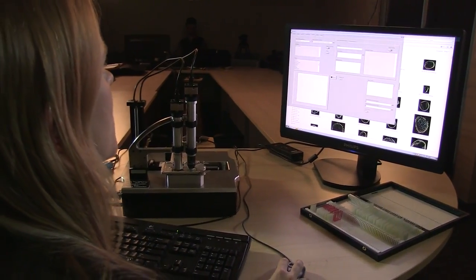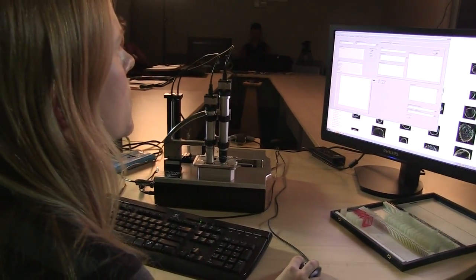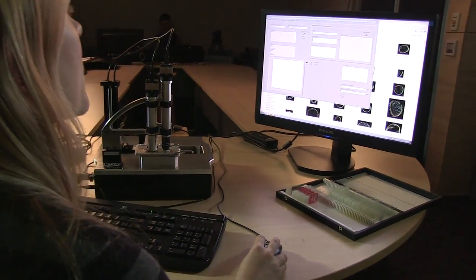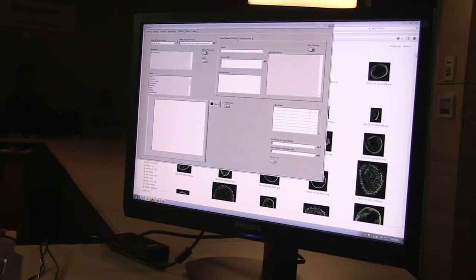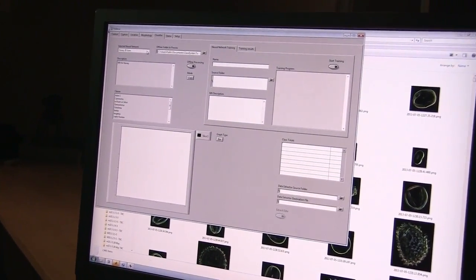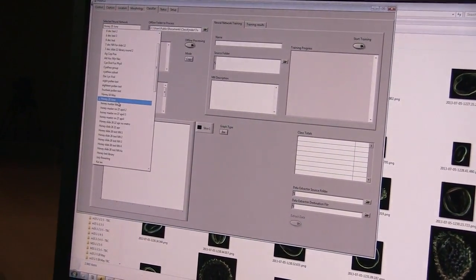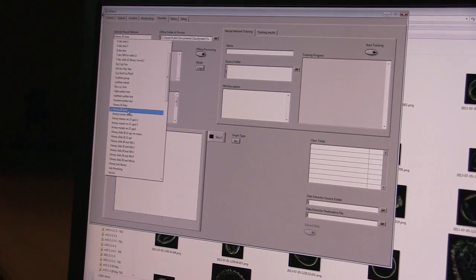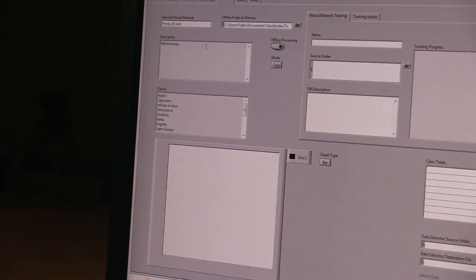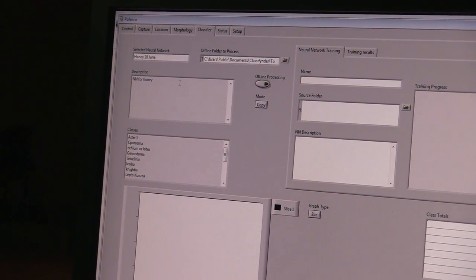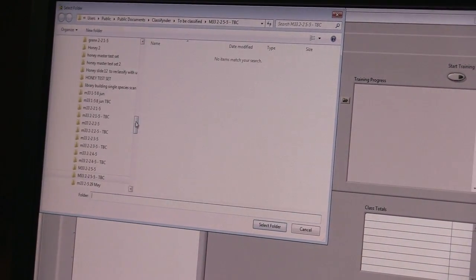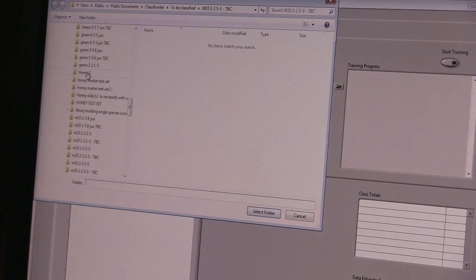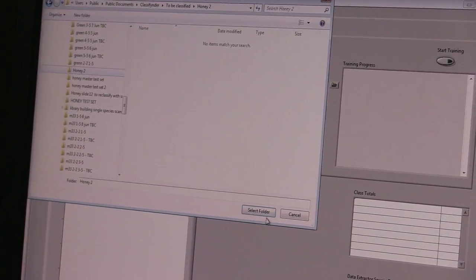So to classify those images shown in the previous folder, the system employs a neural network classification system by which the folder of images is given to the neural network which then compares it with images in library files of known pollen types. And so it's a simple process of selecting your prepared neural network from the list and then selecting the suitable folder of images that we looked at previously and then setting it going.